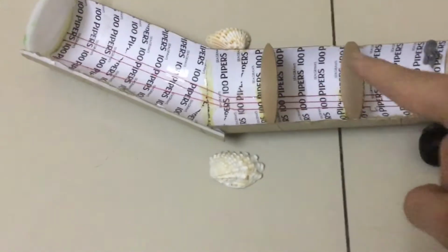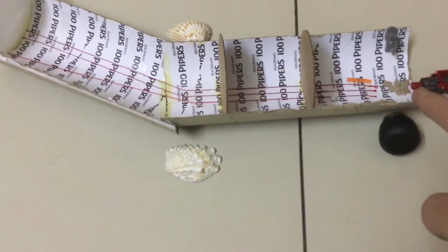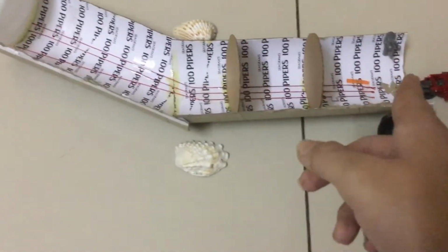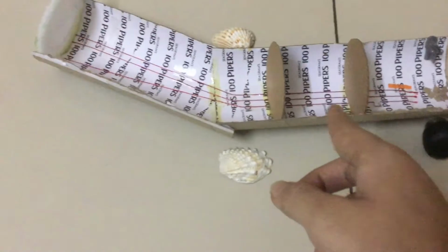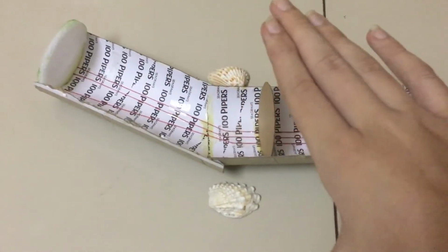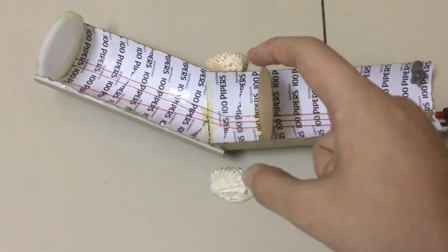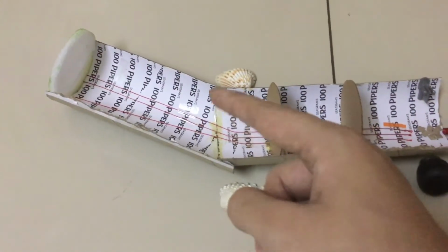Now, we have these two negatively charged plates, and since they are negative, they will attract these positive ions towards them, causing the atoms or the element to increase its speed down this tube. Now, as we stated, they both attract the element, so it goes down this tube, and over here we have magnets, one positive end, one negative end, obviously creating a magnetic field over here. And what this does is, since these are now positively charged, the element will interact with the magnetic field created by these two magnets, and that will cause it to bend its path.